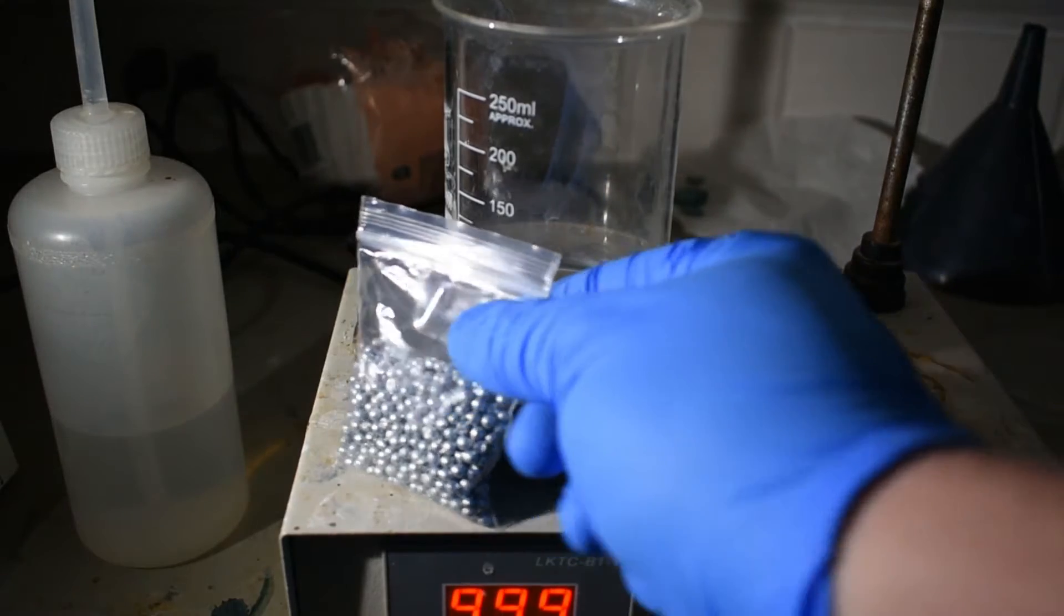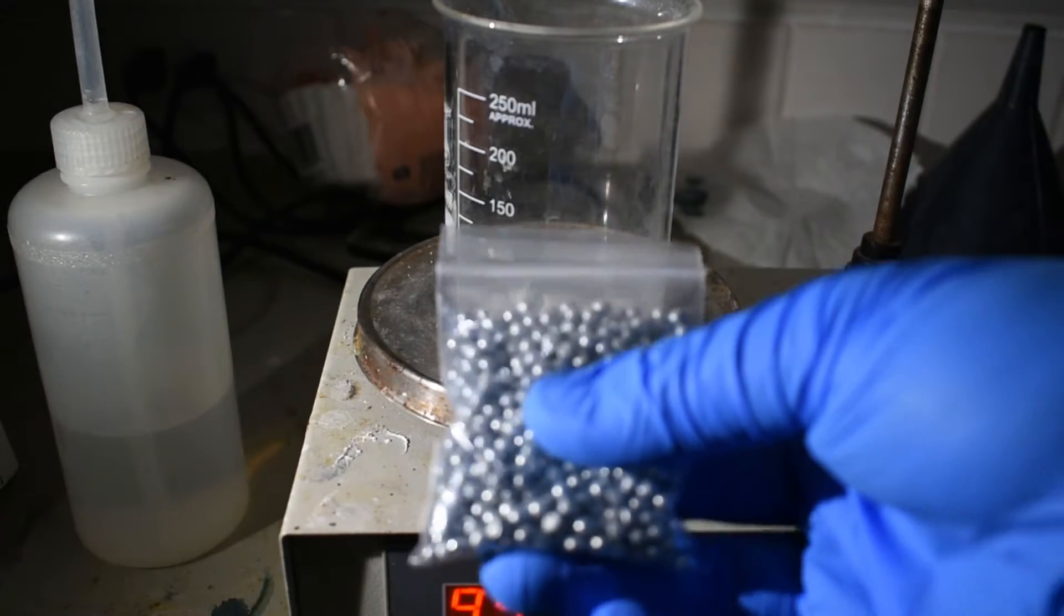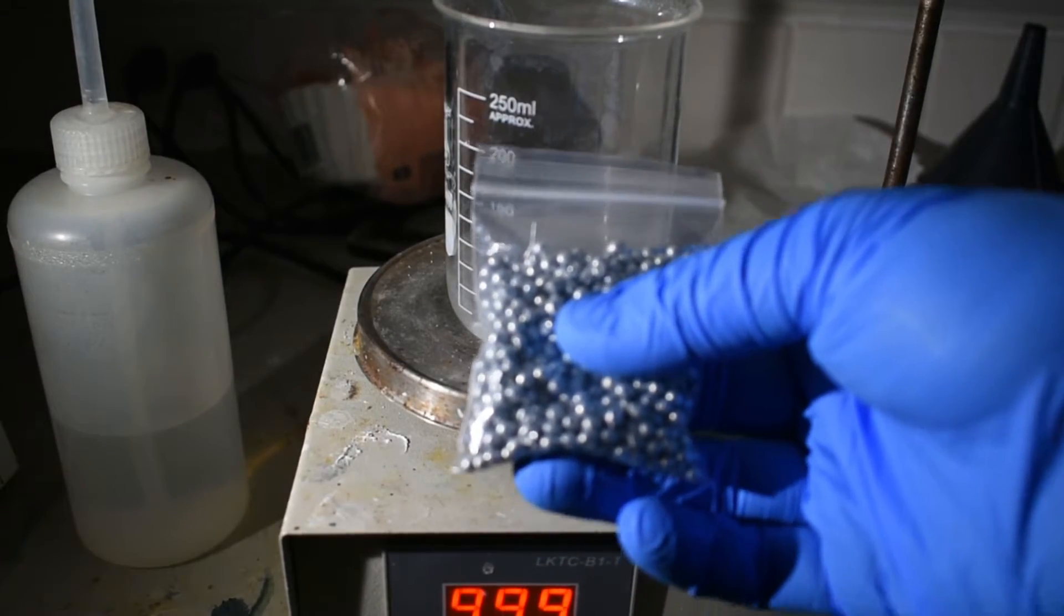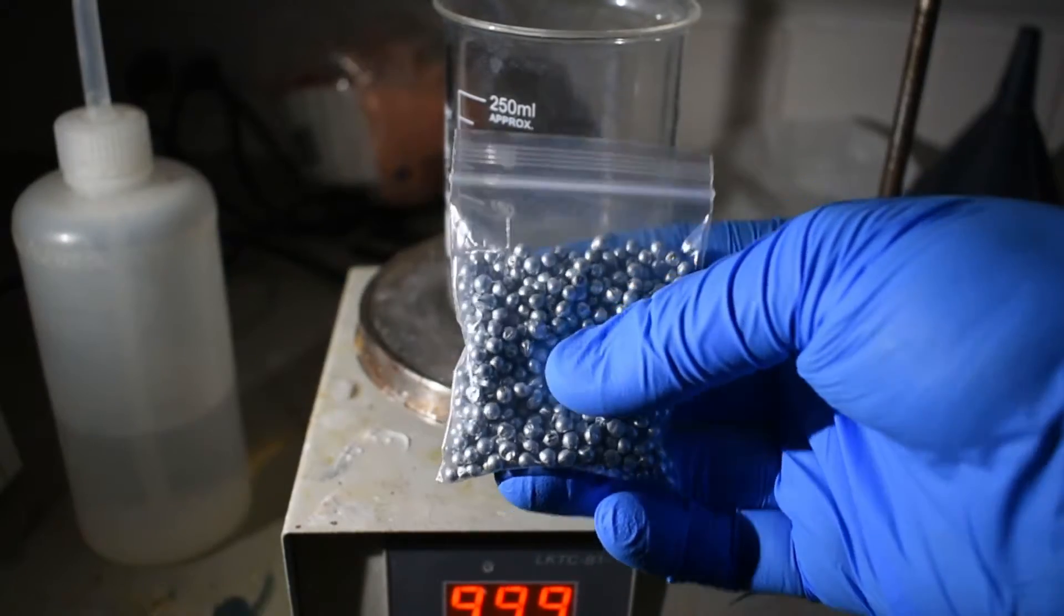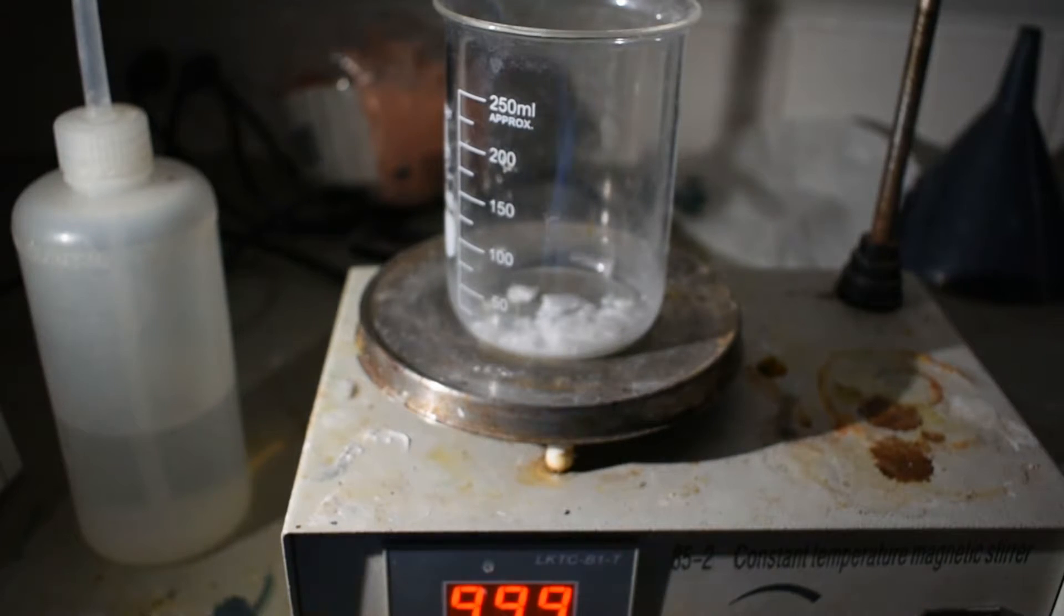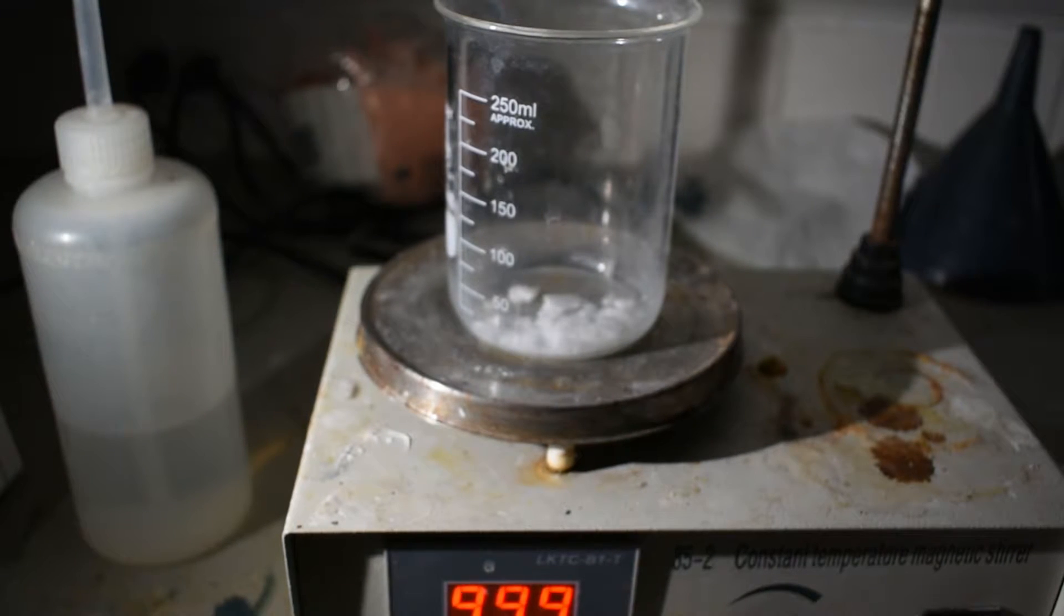And for a reducing agent, I'm going to use zinc. I just have some granulated zinc here, nice, shiny, fresh zinc metal. That will be used to reduce the tetracyanonickelate to the nickel(I) compound.